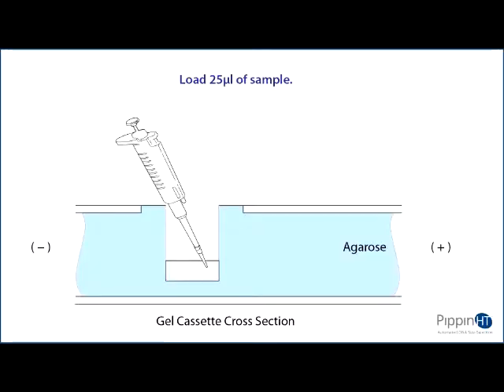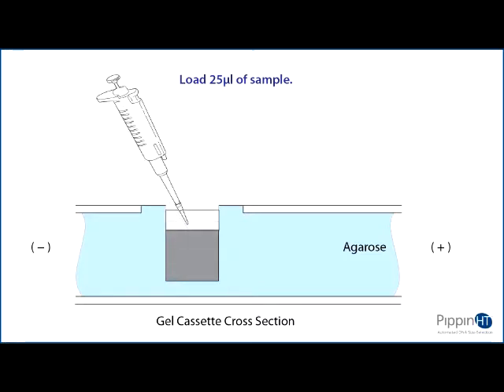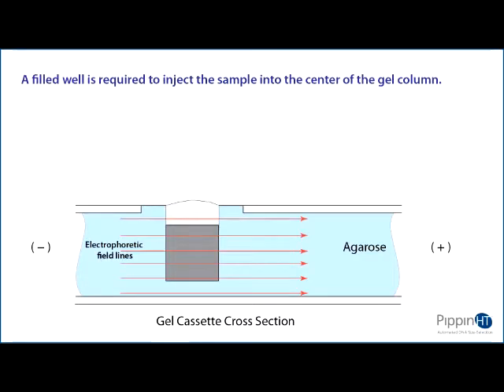Load 25 microliters of sample. When adding sample, place the tip of the pipette just below the surface of the buffer and follow the liquid level up with the tip as it fills. Don't be concerned if the sample well slightly overfills. The density of the sample will allow it to sink before it can flow out of the well.